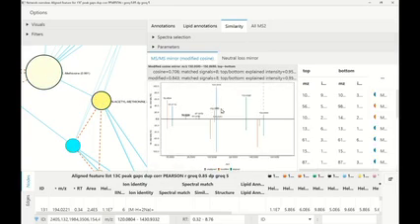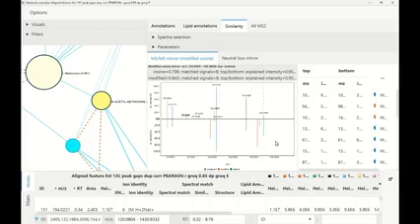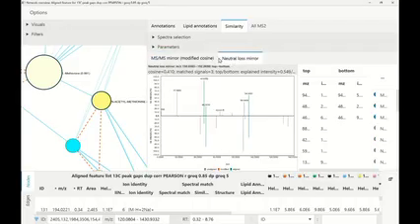And now we see, okay, true, there are some signals directly matching, so they are blue. We can see here blue signals. And then there's also some that are orange. And the orange ones here are actually the ones that are neutral losses. So they also match, but they match by a neutral loss. And we can switch this over by just turning our spectrum into a neutral loss spectrum.